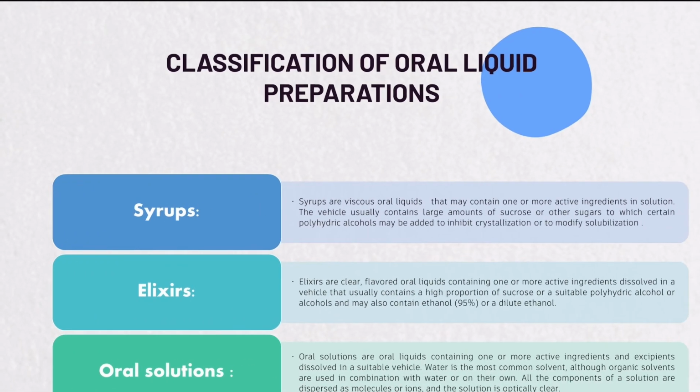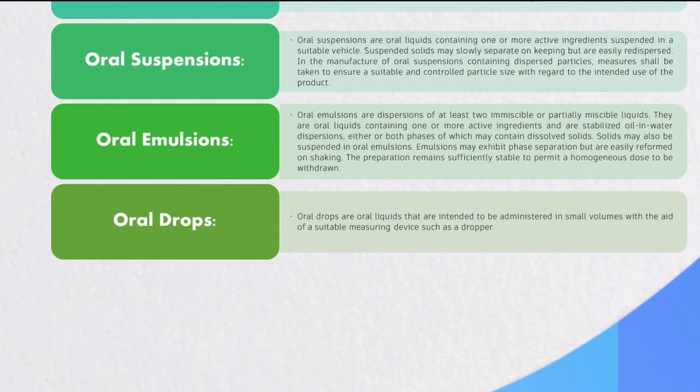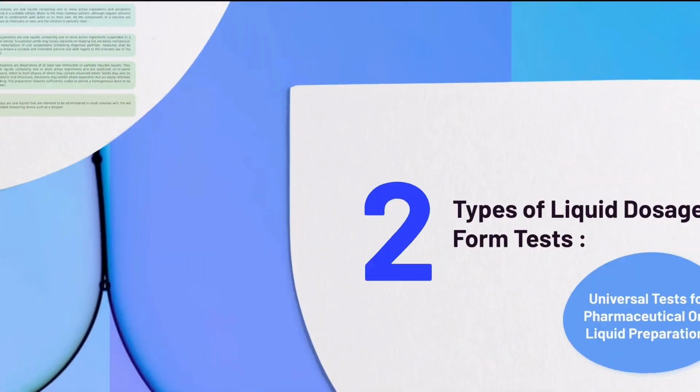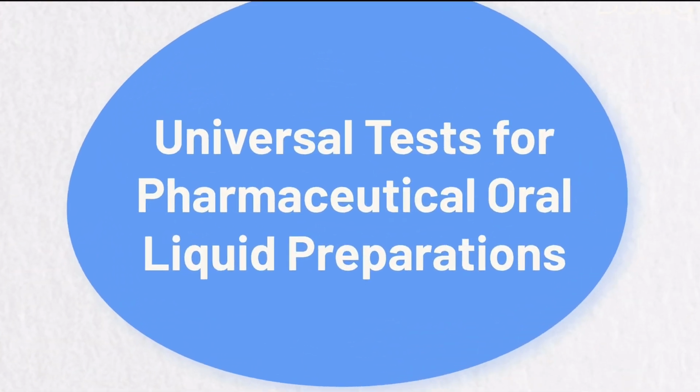And here is the classification of oral liquid preparations. Second point, types of liquid dosage form tests. Universal tests for pharmaceutical oral liquid preparations.